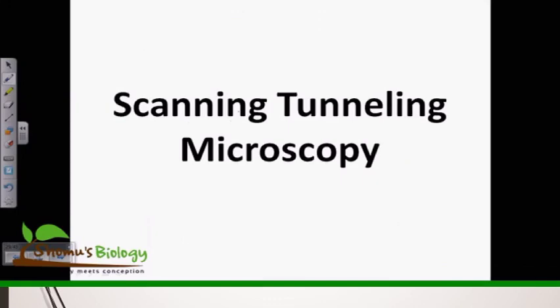Now, scanning tunneling microscopy is one of the major advances in electron microscopy, and it's a different kind of microscopy from what we use. Up till now we have talked about microscopy with a light source, called light microscopy or bright field microscopy. Then we have also seen that using electrons, we can look at very high resolution images using the scanning electron microscopy as well as the transmission electron microscopy. So it's electron as a source.